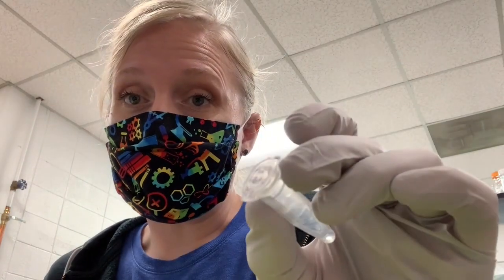Okay, so now I have in the blue droplets the water, the formaldehyde loading dye, and my 1 microliter of my 1 to 10 dilution. Before I set up my gel, I'm going to take this formaldehyde load dye back to the freezer. I'm also going to put my double-stranded RNA samples into my personal freezer box, just because I don't want to forget about those and have them degrade while I'm working on my gel.